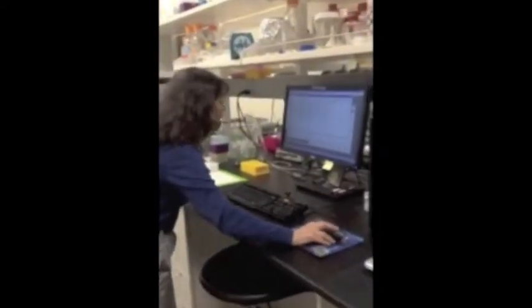Here I have an example of what you might see in an actual microdialysis sample. And here you can see this nice peak, that's dopamine. This shows us the amount of dopamine that's in the nucleus accumbens of the rat. This is a region that's very associated with reward, but can also be affected by stress.